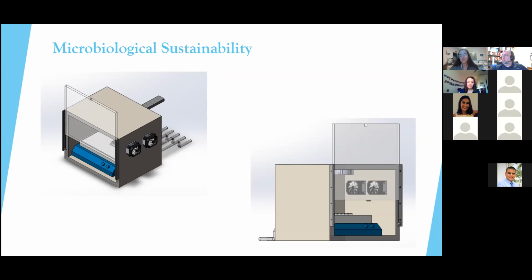Also, the orbital shaker that you're buying off the shelf, how do you plan on controlling it? Because I'm assuming if it's off the shelf, it's going to have some sort of hand controls on it, because typically that's how you would use it in a laboratory setting. So how are you planning on adapting that to be automated with your control system? Good question. Ideally, the goal would be to rewire it and add a control system that would attach itself to the remote computer and then be able to control it from there, as the remote computer would be able to control all of the device.